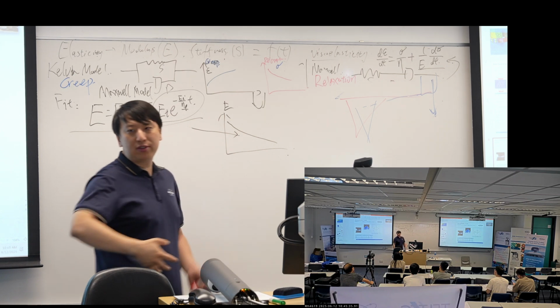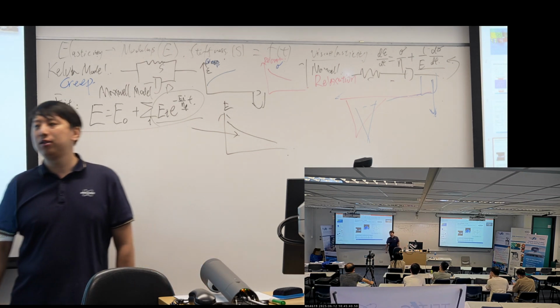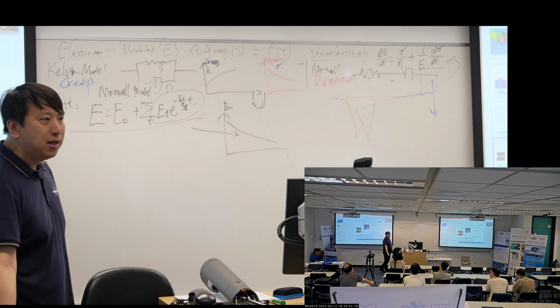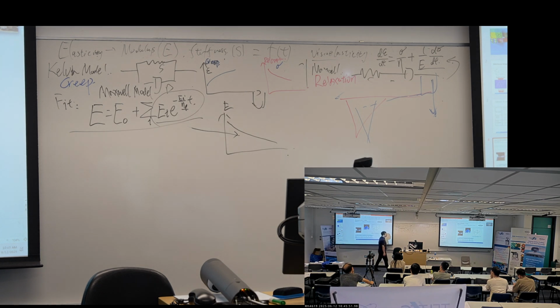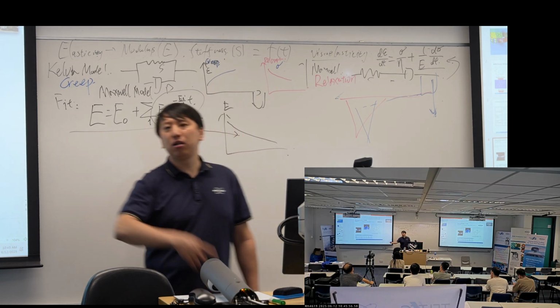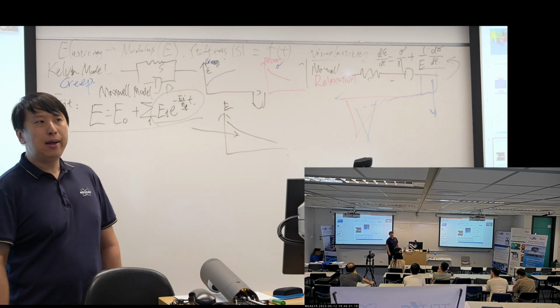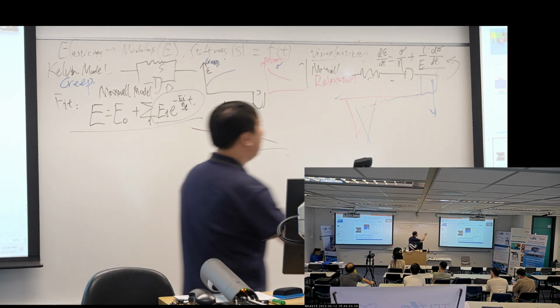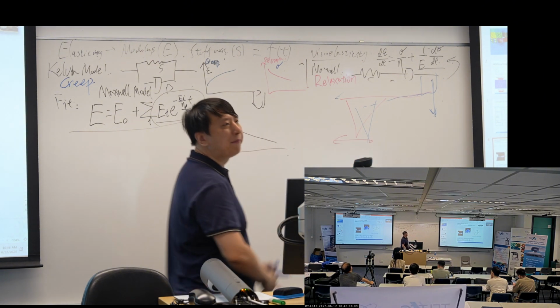But if we want to study the materials like Dr. Wei introduced yesterday, if we want to study the diamond, the modulus or the mechanical property of diamond, or some super hard materials like tungsten carbide, for those things we need to apply large force. Maybe goes to several micronewtons to millinewtons, and in that condition, this lateral movement will be significant.